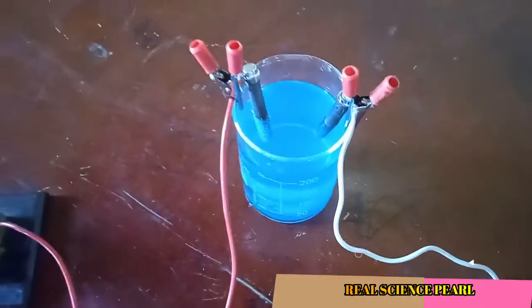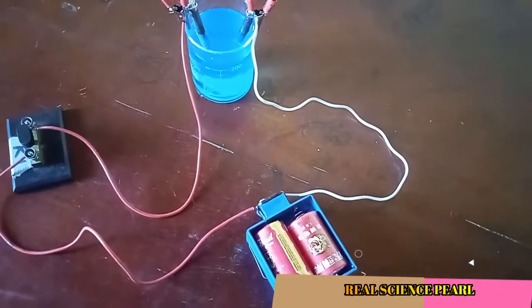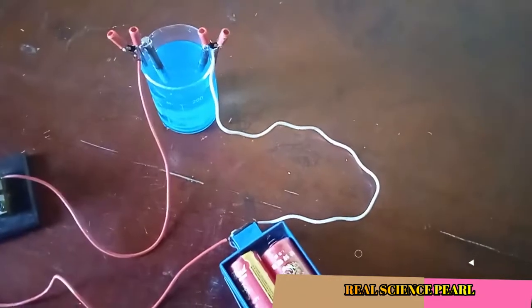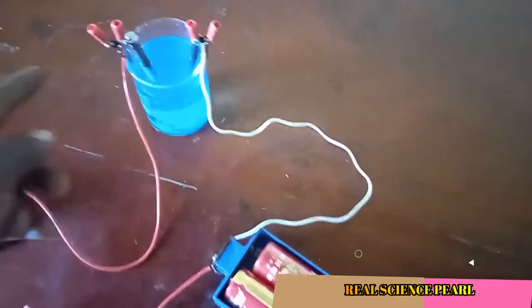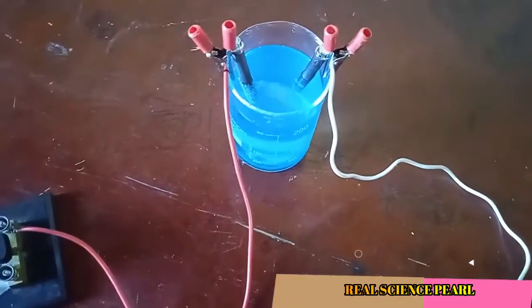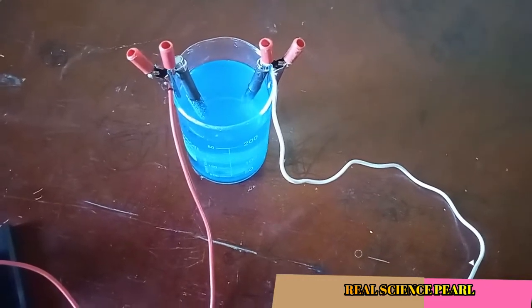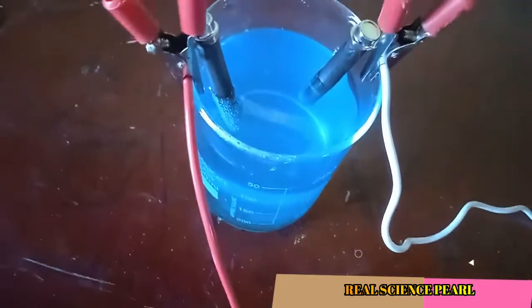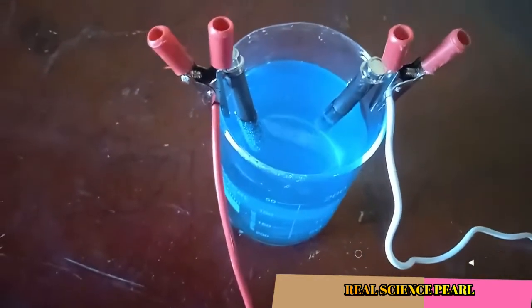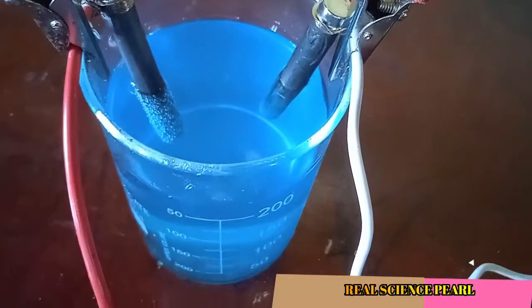As you look at mine, I used 2 dry cells at first, but when I realized copper was not forming very fast, I had to increase the number of dry cells so as to increase the electricity being used to discharge the copper at the cathode very fast, so that we can see it.